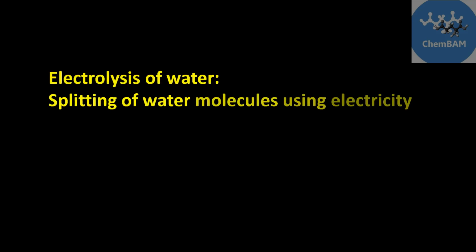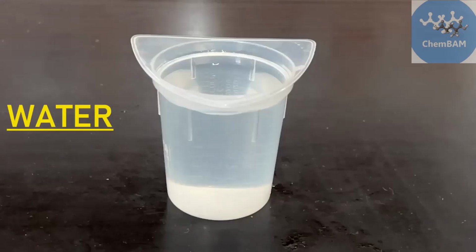In this video, we will be discussing the electrolysis of water. The electrolysis of water is the splitting of water molecules using electricity. You will need the following apparatus.